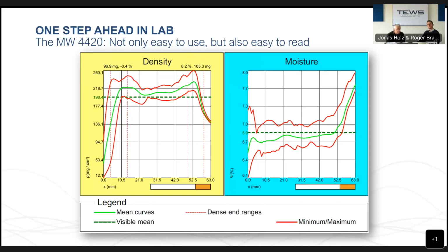By taking reference methods for your kind of cigarette in an oven or something else, you can determine the discrepancy between our standard tobacco reading and the reference value, and program the 4420 to compensate for this offset as a calibration.